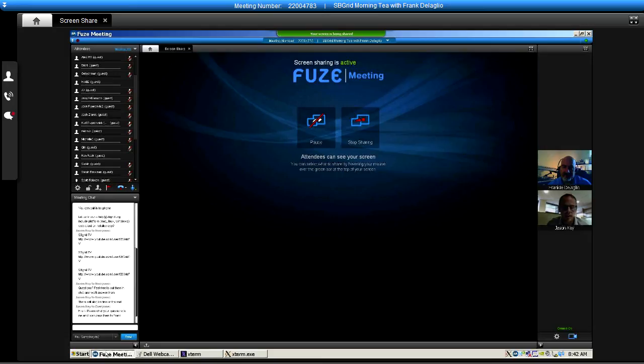I thank you very much, Frank. I really appreciate it. I think it's really informative, and I know my spectra always look best in NMRDraw for some reason. The contour maps always look great. Then I switch over to something else, and I think, oh, okay, it looks better in NMRDraw.